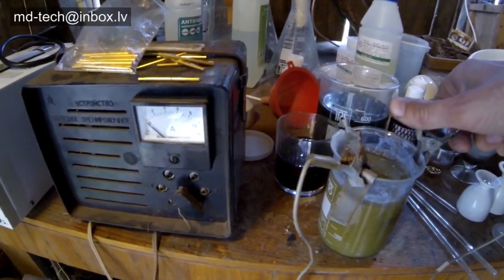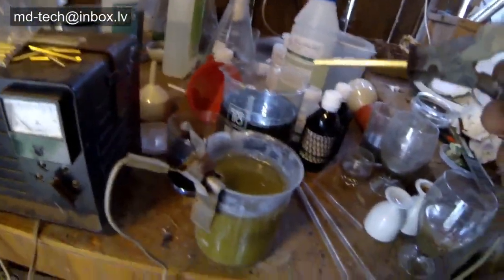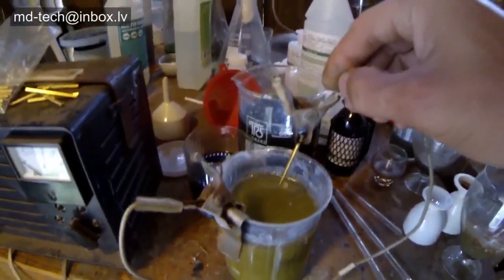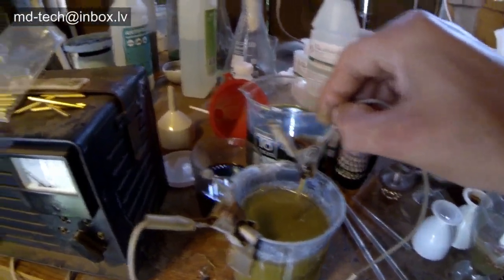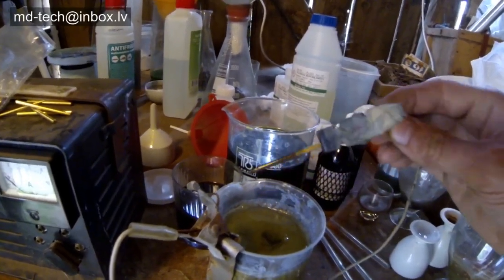In the beaker I make a very saturated table salt solution. This salt liquid very quickly strips the gold layer from the pins. You need to use a stainless steel cathode — this is the negative terminal — and the positive terminal or anode is the gold-plated item.